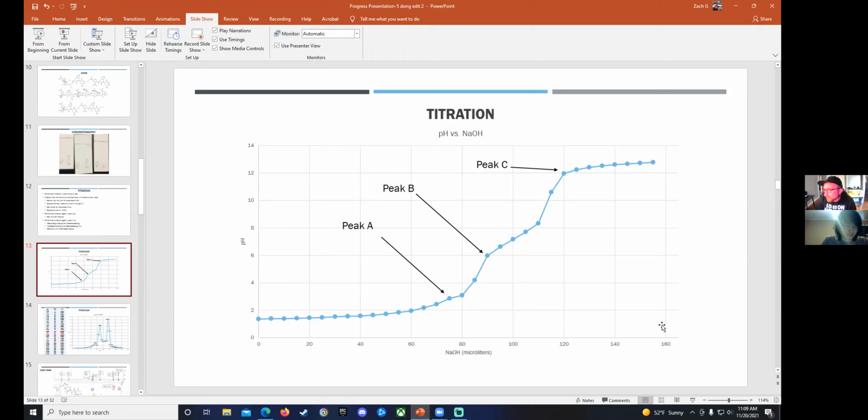Our NaOH was, I believe, right around the 200s before I even saw anything occur, and when it did, instead of a nice flow and identifiable peaks, it just shot up exponentially, more of a straight line, and then leveled out again. So we saw much better results.